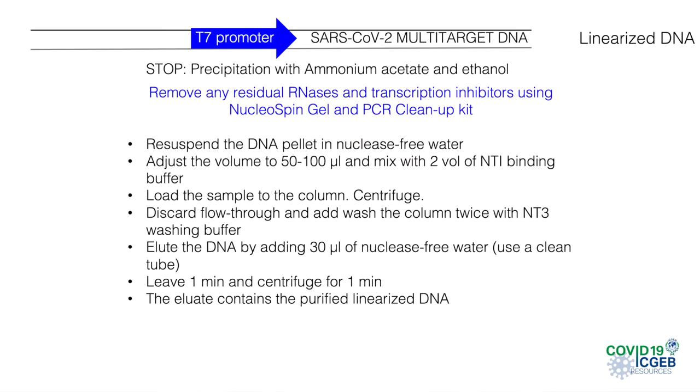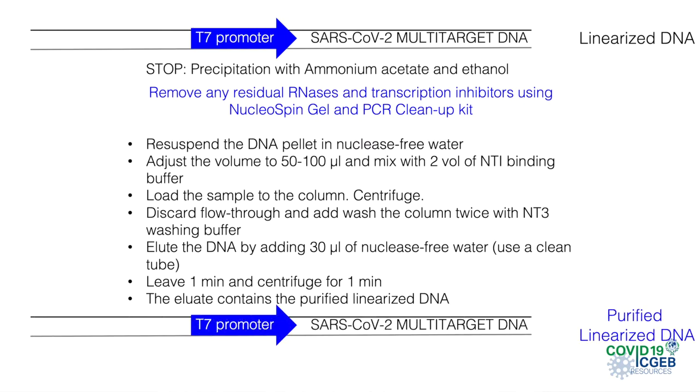The procedure is done using Eppendorf test tubes and a microcentrifuge. Remember to always use sterile and RNA-free material in all steps. The digested DNA is mixed with two volumes of the binding buffer NT1 and loaded onto the column. The column containing the sample is then centrifuged. The eluate is discarded since the DNA is bound to the column. The column is washed twice with the NT3 washing buffer and placed in a new clean tube. After that, we add about 30 microliters of nuclease-free water to elute the DNA from the column. We leave for one minute, then centrifuge again, and the purified DNA will be in the eluate.